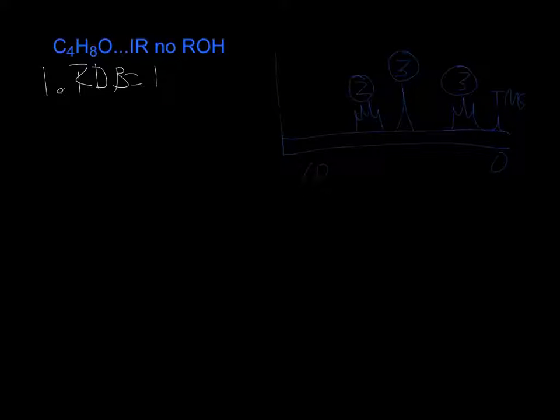Okay? And then number 2 on our little checklist was, if I remember right, check the IR, which the IR here was given. The IR showed that there are no alcohols. And sometimes you don't have that luxury. Of course, in lab this week, hopefully everyone got the chance to use the IR spectrophotometer, it's really cool. It's really obvious usually whether or not there's an alcohol or carboxylic acid present. All right, so this already told you that the IR showed there are no alcohols.